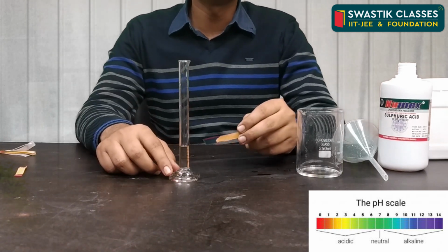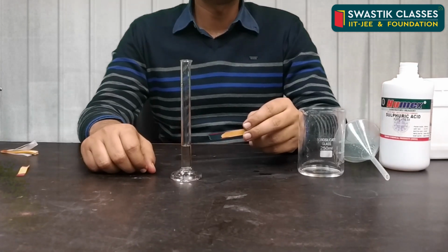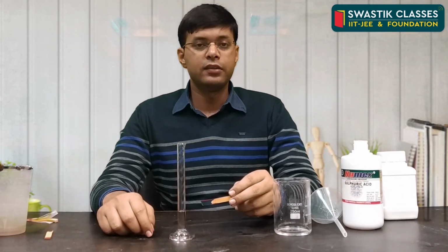And this exercise depicts that acid and base can neutralize each other and thereby change the nature of the solution.